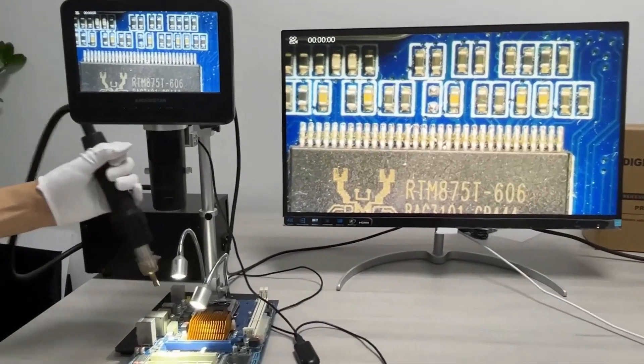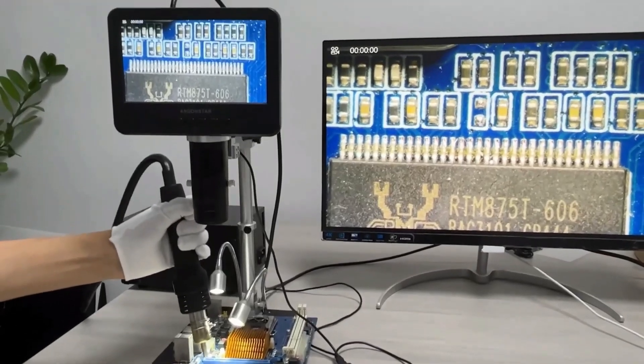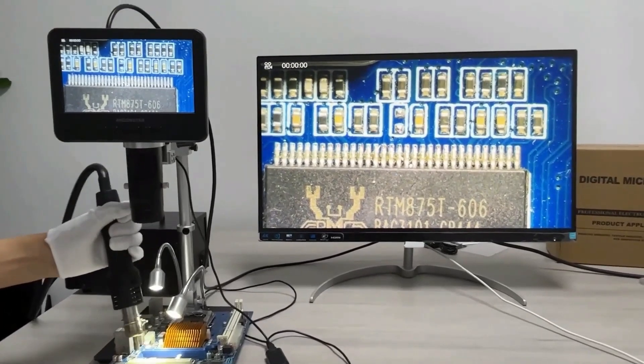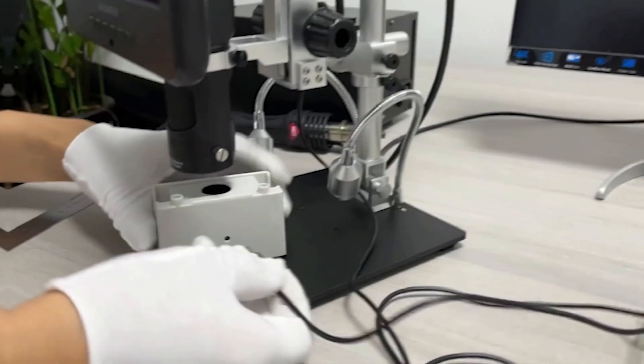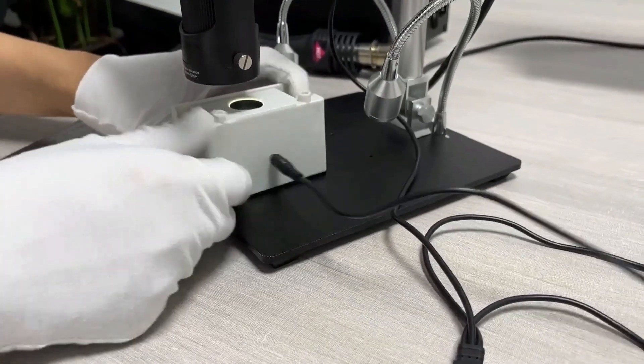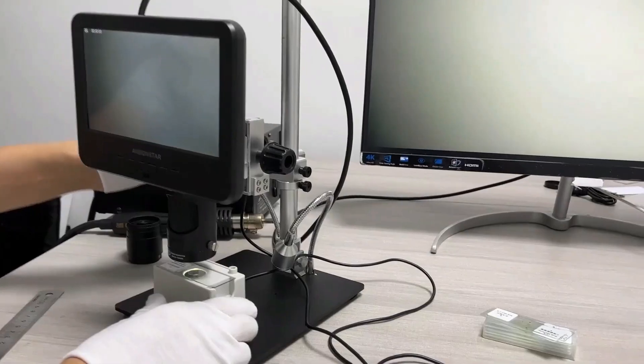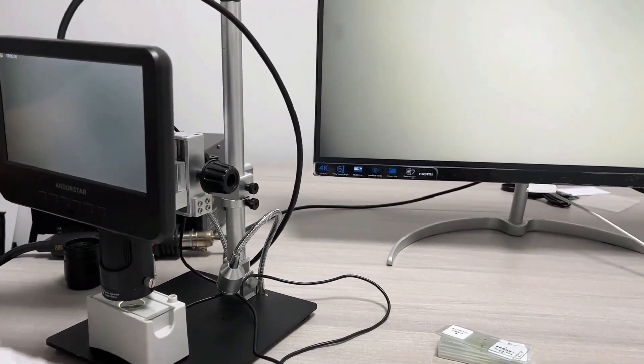Lens L is perfect for soldering and repairing circuit boards and mobile phones. Lens A allows you to observe whole coins, parts, plants, and stones, while Lens D is designed for examining biological slides. With this setup, you'll have the tools you need to dive deep into your hobbies or projects.